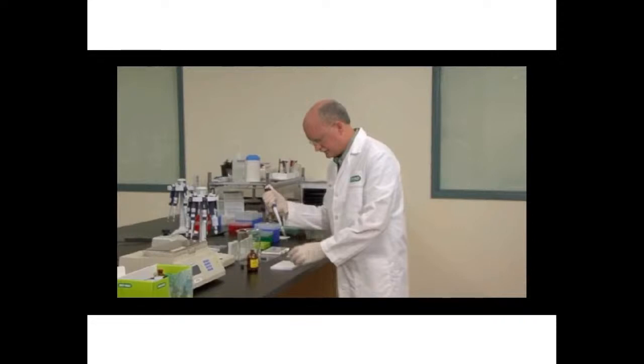I am going to use Biorad's Criterion precast gels, which accommodate the 11 centimeter IPG strips that we ran earlier. Prepare the gel by removing the sealing tape from the bottom of the gel and slide out the comb from the top. Rinse the wells with good quality DI water.